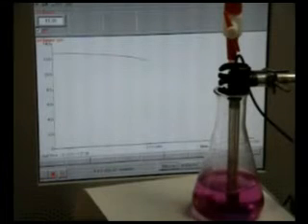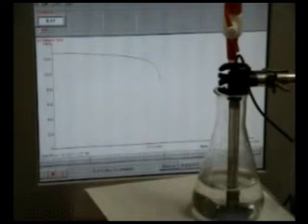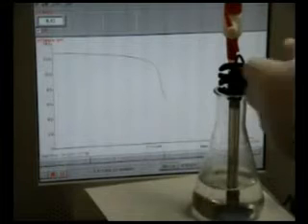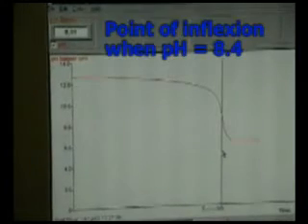As the equivalence point is approached, the pH curve is seen to dip steeply. The indicator's end point is seen before the steepest part of the curve is reached. The pH of the actual equivalence point is determined by visually analyzing the graph for the point of inflection.